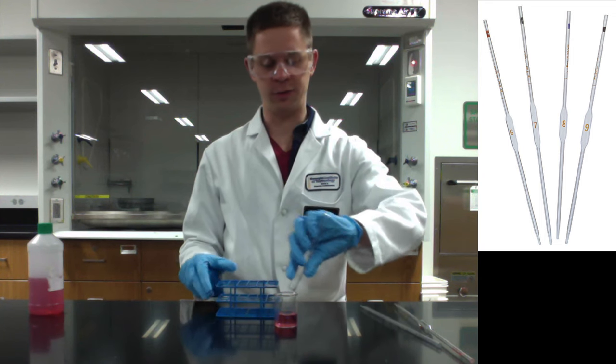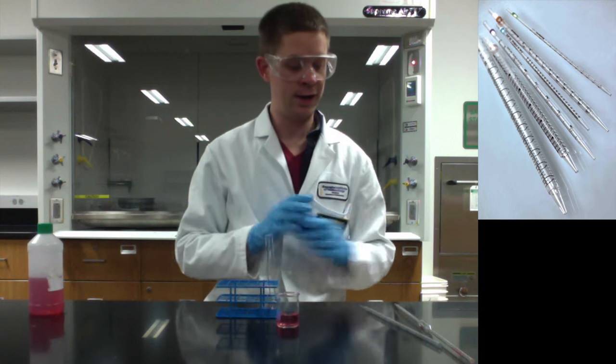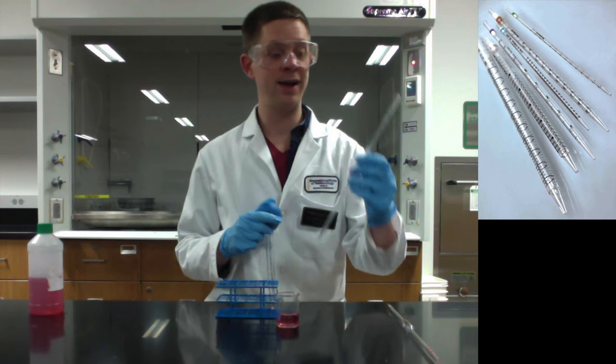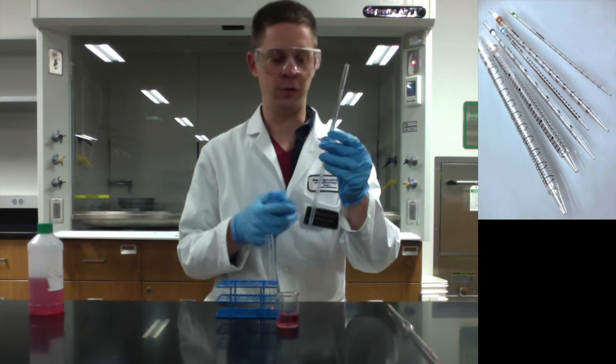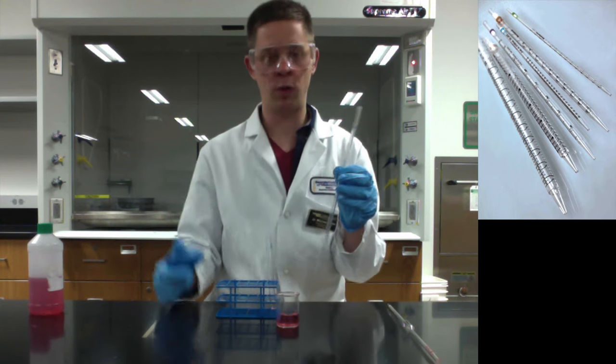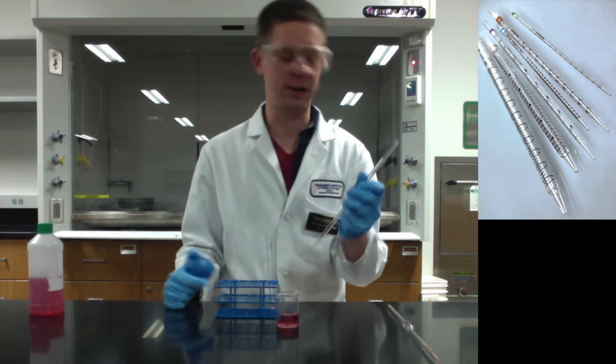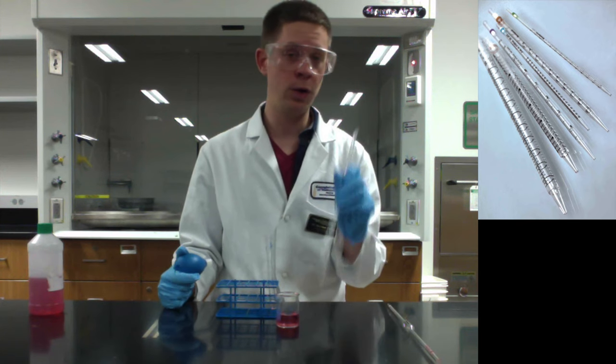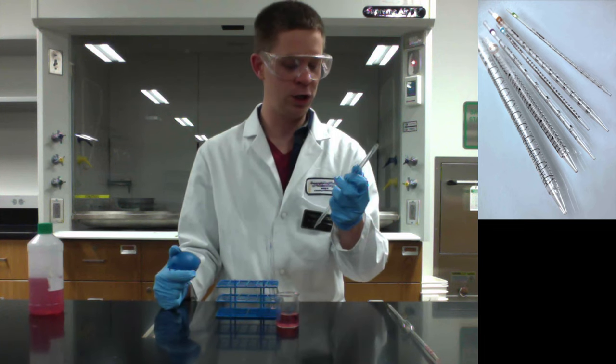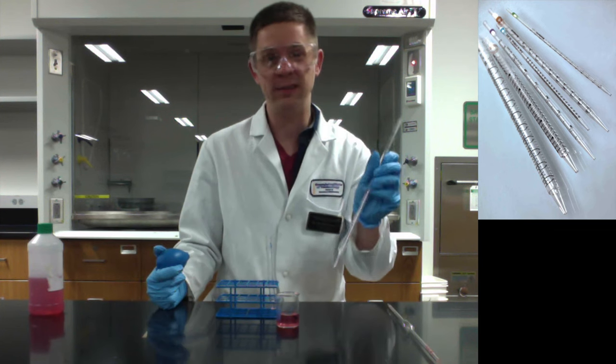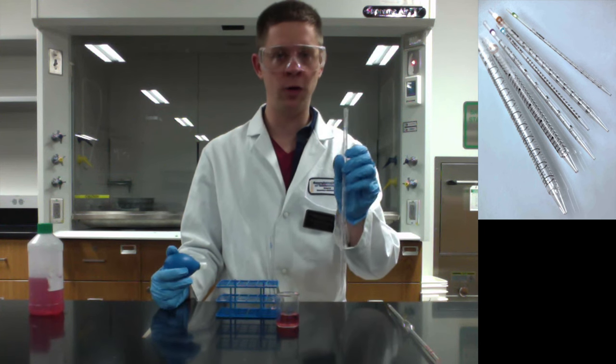Let's talk about the serological. The serological is in some ways a little more tricky because you have a variety of volumes to choose from, right? Depending on the marking that you want to do. So for example, we might be working with a reaction that let's say precipitates a cobalt complex or a cobalt compound. And maybe we only want a certain mass of that compound out of our reaction. So we only want to use let's say 2.6 milliliters of cobalt solution in this.